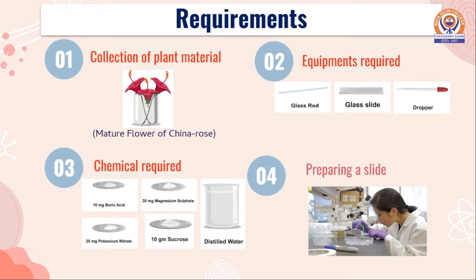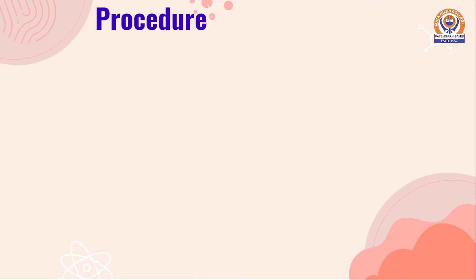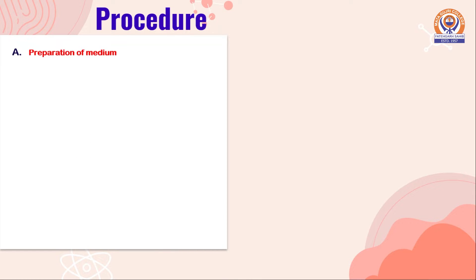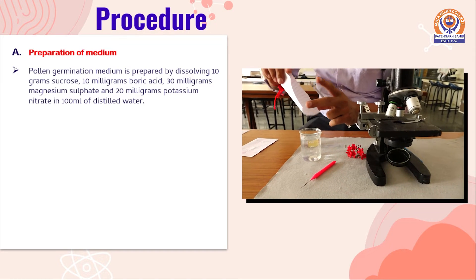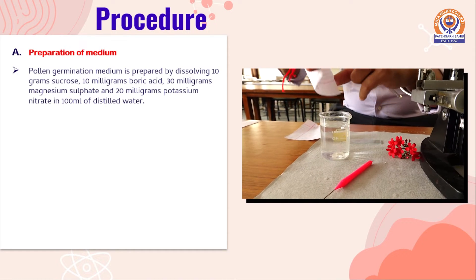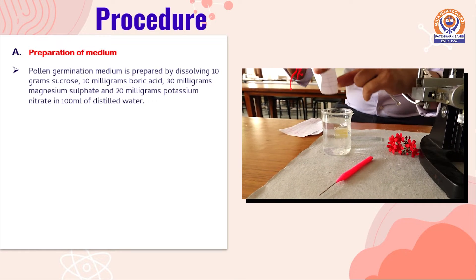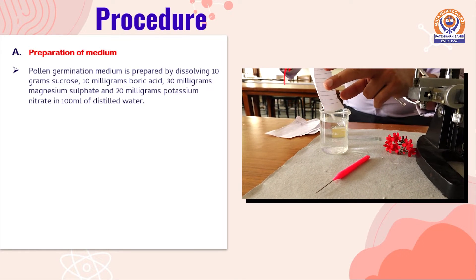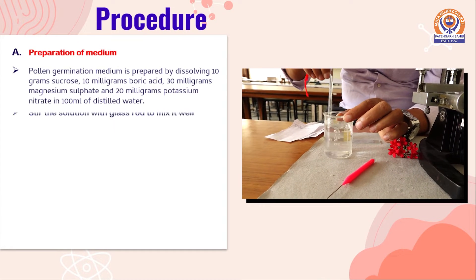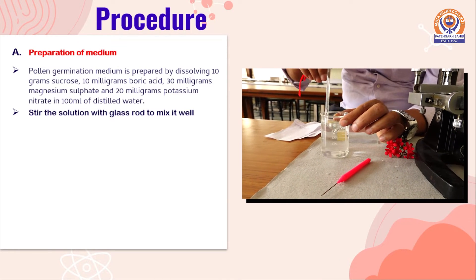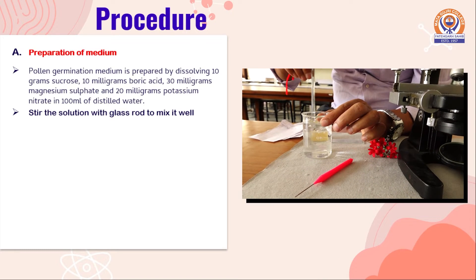The procedure is divided into two parts. The first is the preparation of medium. Pollen germinating medium is prepared by dissolving 10g sucrose, 10mg boric acid, 10mg magnesium sulphate, and 20mg potassium nitrate in 100ml of distilled water. Stir the solution with a glass rod to mix it well.